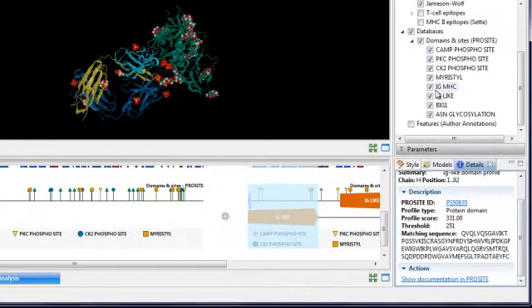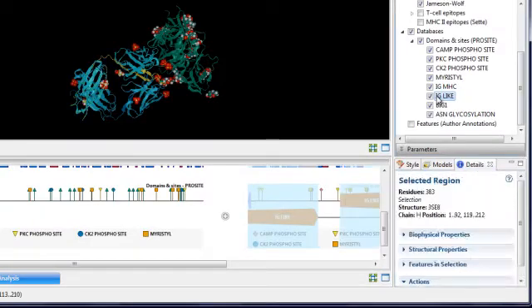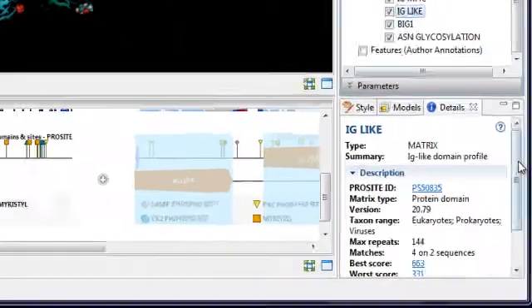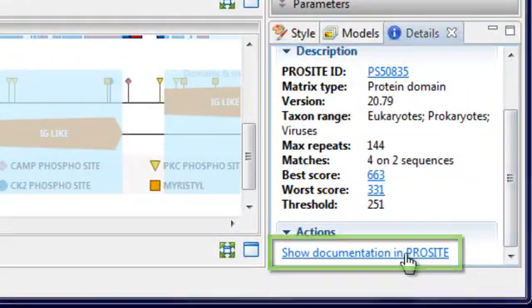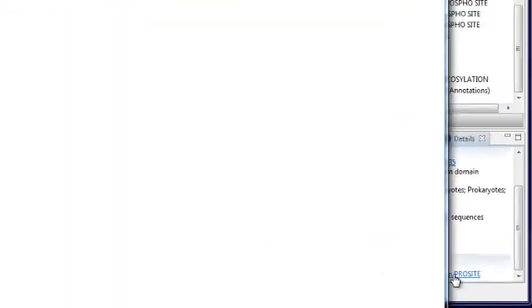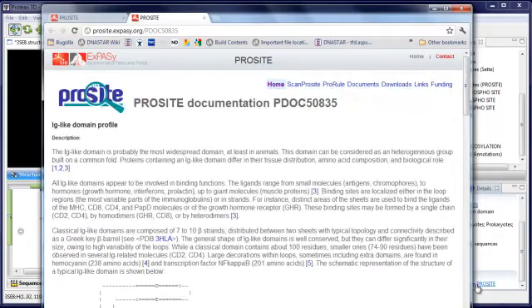Again, let's select all the IG-like patterns. If I then click show documentation in PROSITE, I can read more about this domain.